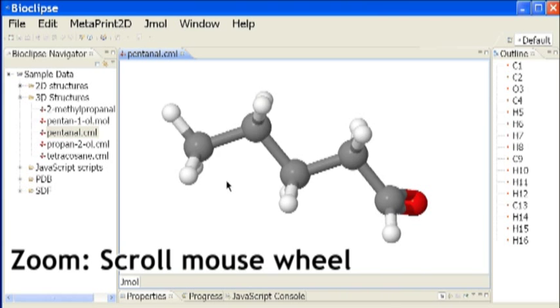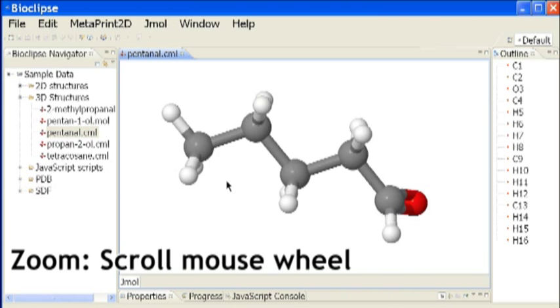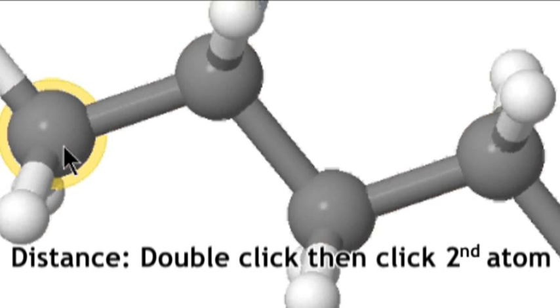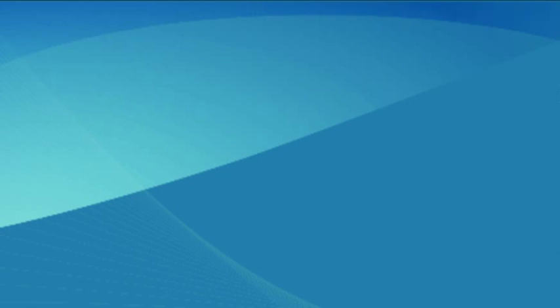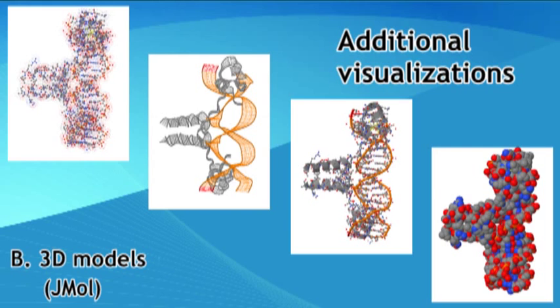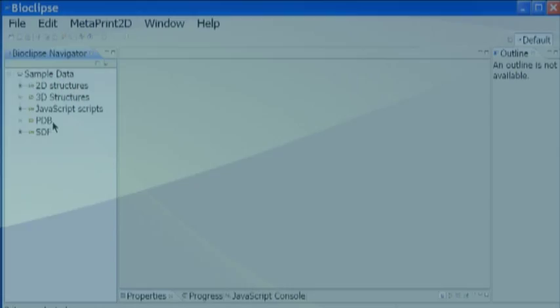To zoom in and out, scroll the middle mouse wheel. To measure a distance, double-click on one atom then click on a second atom. To measure an angle, click a third atom. JMol provides additional visualizations.